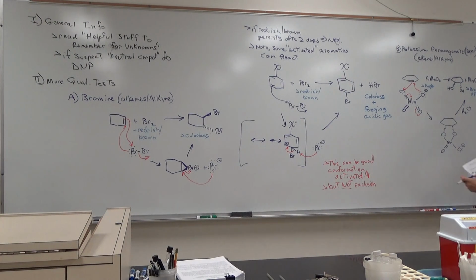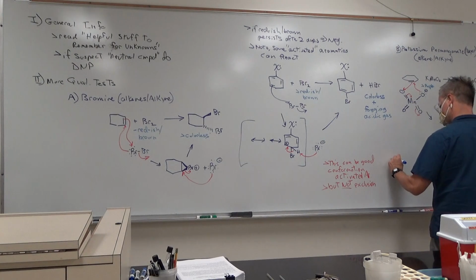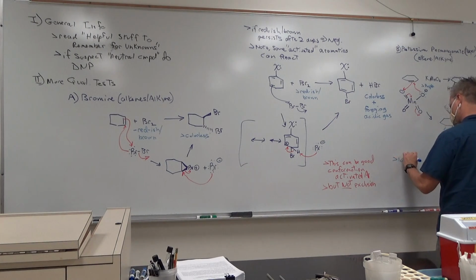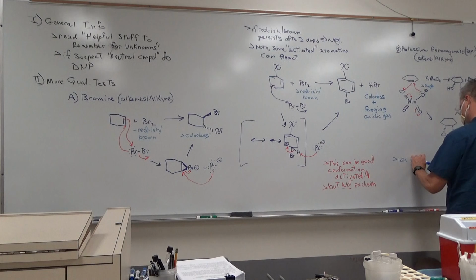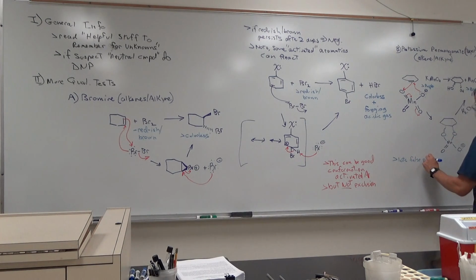Okay, for this test, there are lots of false positives. Potassium permanganate is a very reactive chemical.